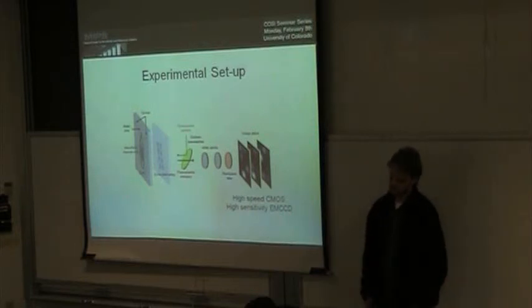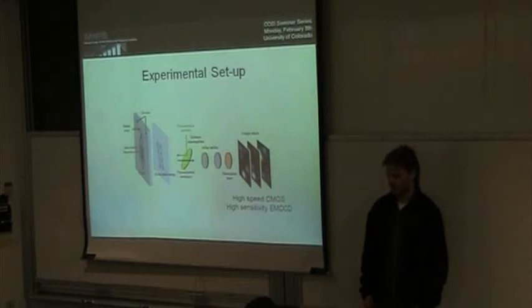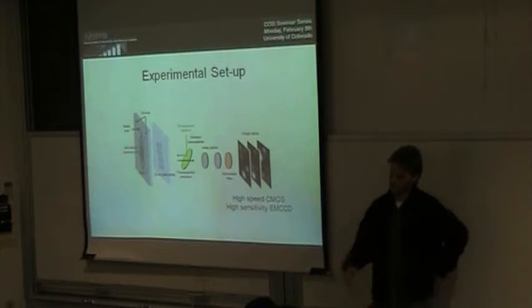There's a variety of things you can do. If you just do it the dumb way, you get some Poisson distribution of how many entities you end up in each drop. But there are certain things you can do that do beat that distribution. We can talk about that more later, but like the order of the loading.